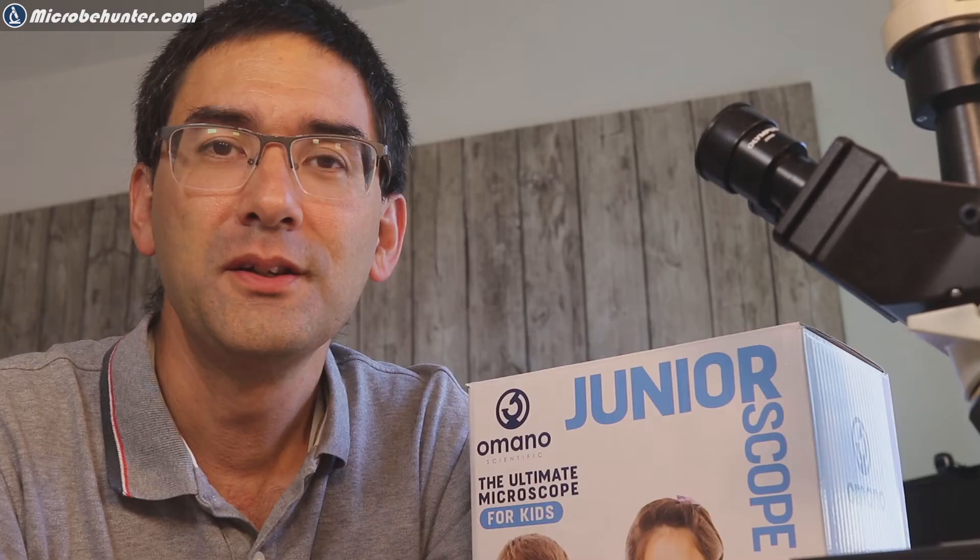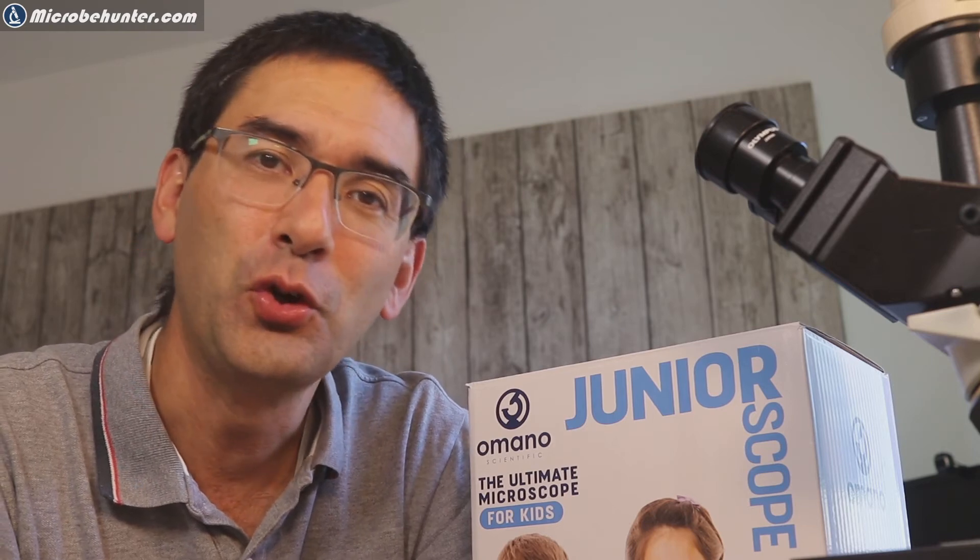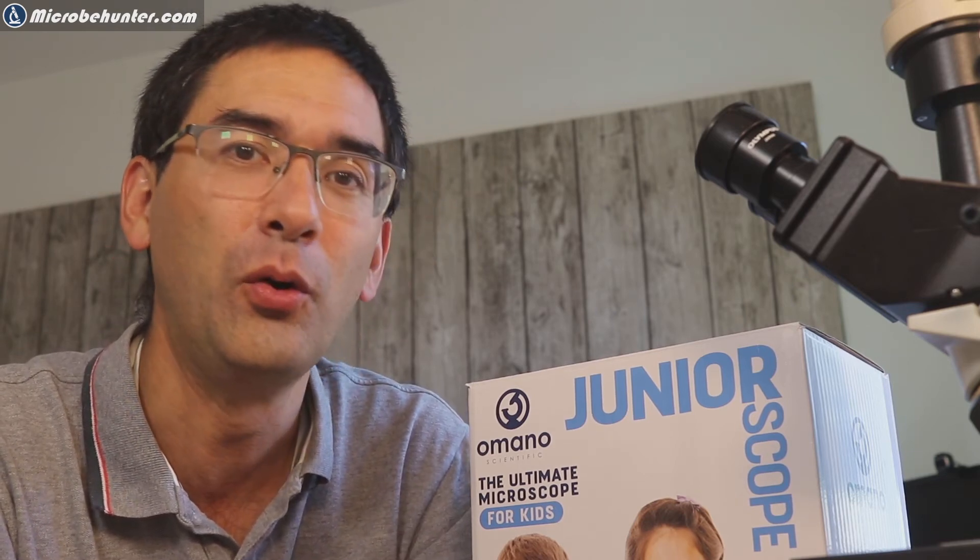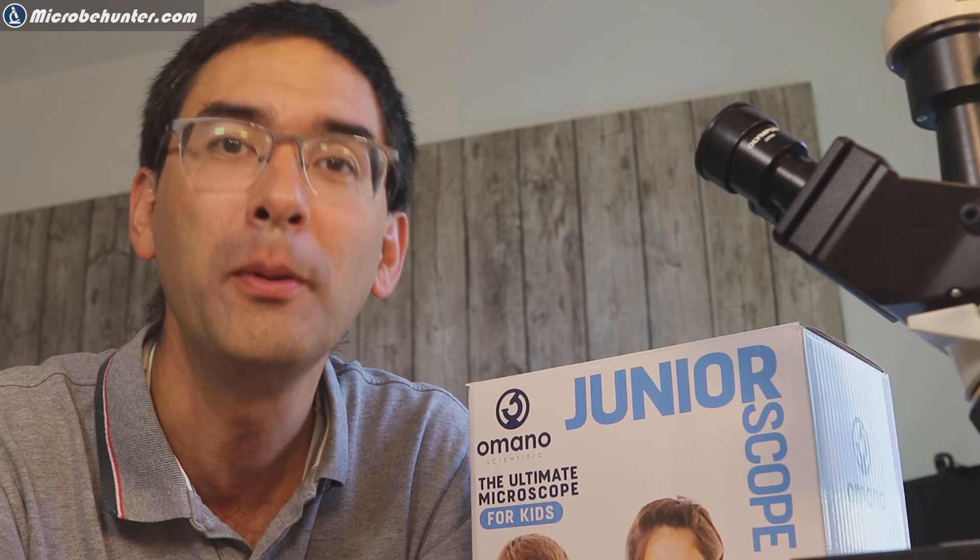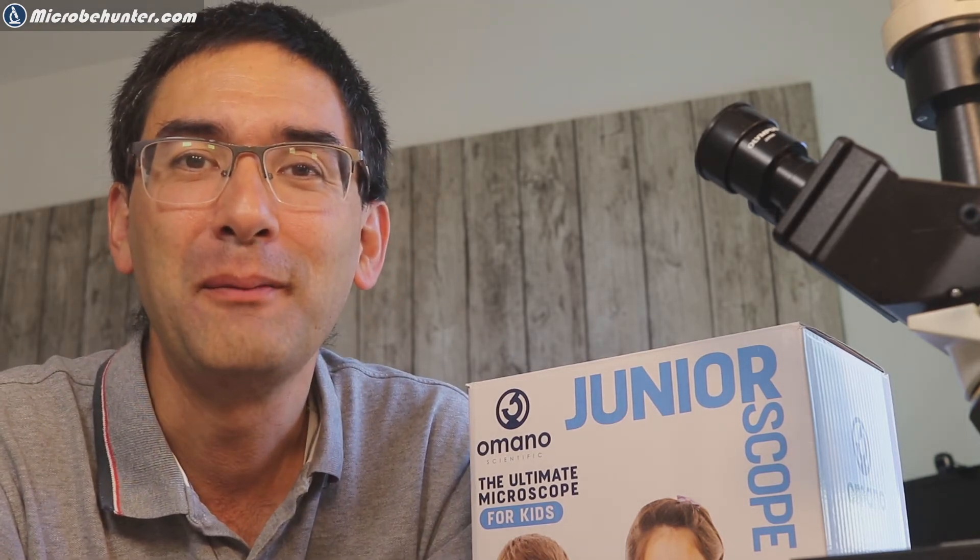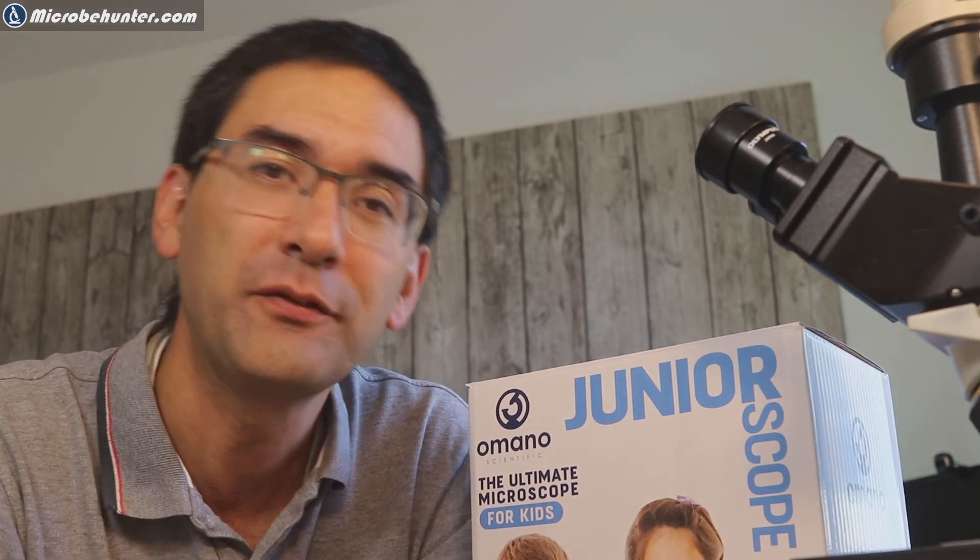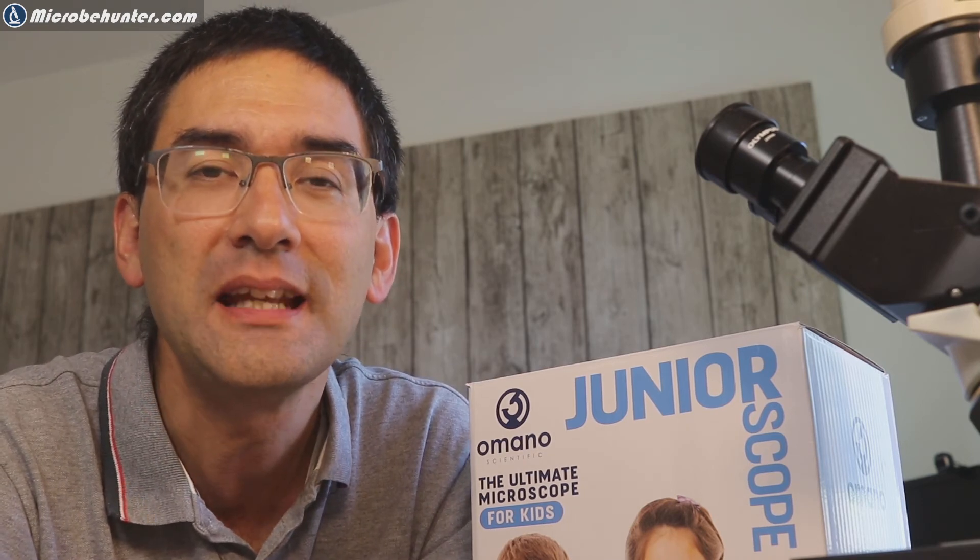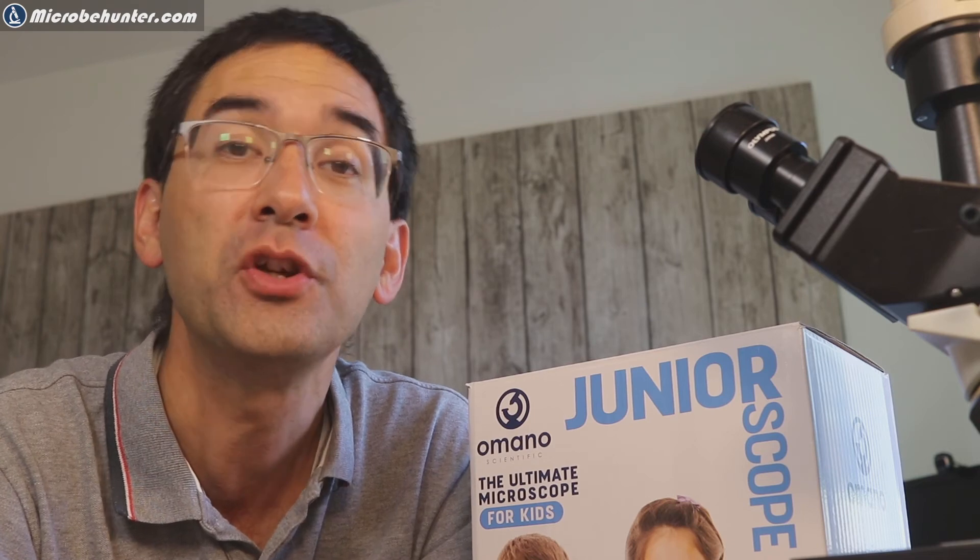So what are now some of the differences of this microscope to other comparable microscopes for children? Well there are two differences as a matter of fact. One difference is that this microscope only has one focus knob. That's an advantage and a disadvantage at the same time. The advantage is that children have an easier time probably because they don't have to switch back and forth between the two focus knobs but the disadvantage of course is that you need a slightly more stable and steady hand when you're focusing, especially when you're using the high power objective, the 40x objective.